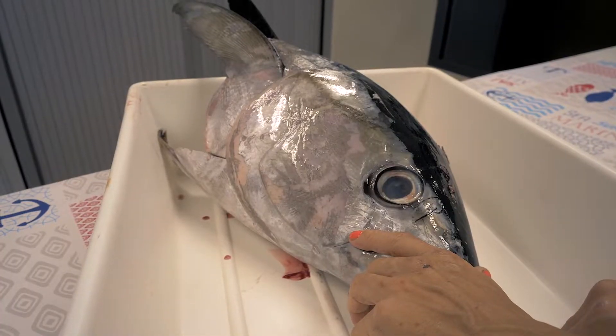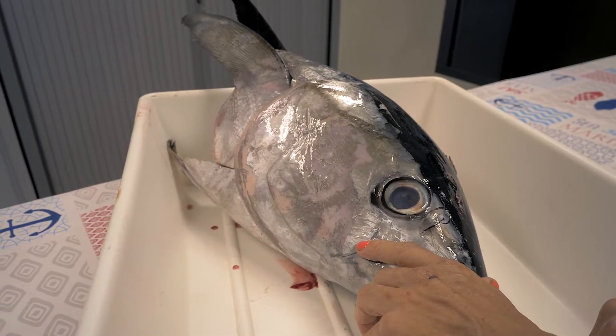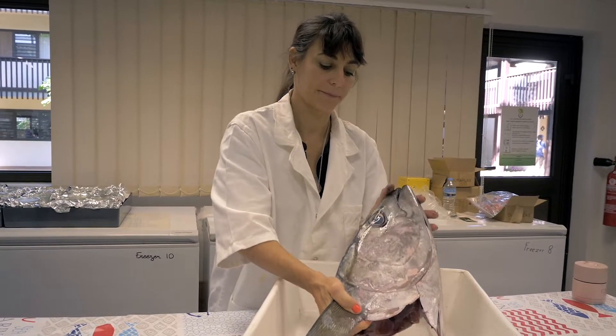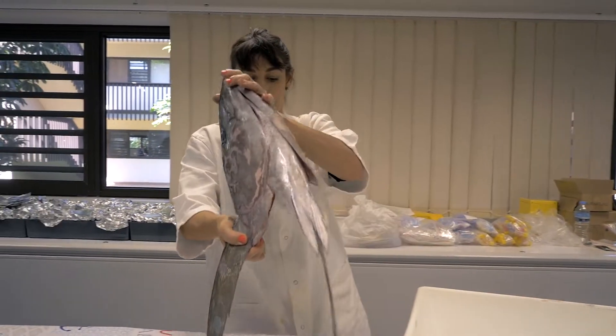I'm going to show you first how to extract the otoliths from the head only. Here we have a large yellowfin tuna. Then I will extract the otoliths from a whole skipjack tuna.